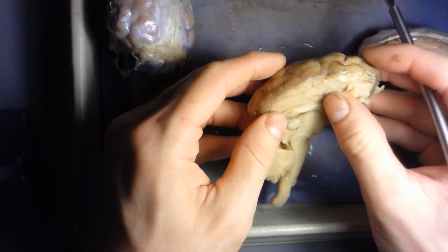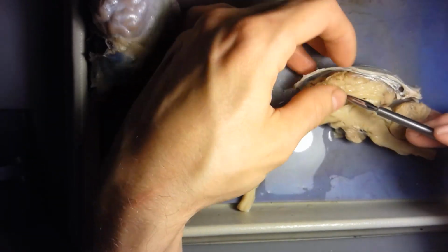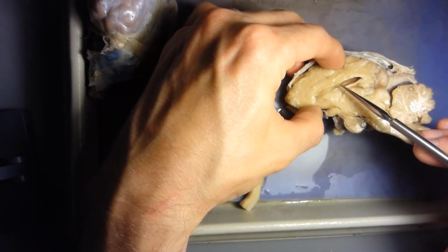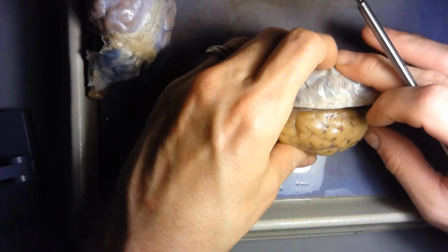If I turn this over, you've got the corpus callosum. Okay, so that's how I'll use this one because I can separate it a little bit better here. So the corpus callosum is the ceiling. Remember we talked about the ceiling, so the corpus callosum is the ceiling. You got your fissures that you can see really well.